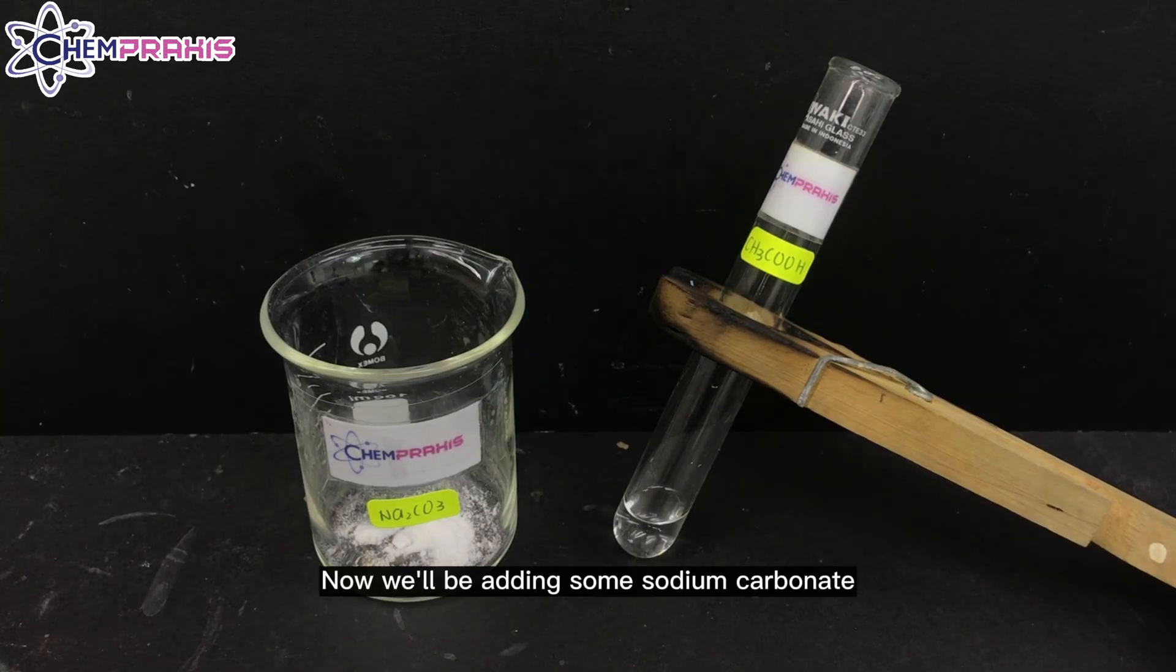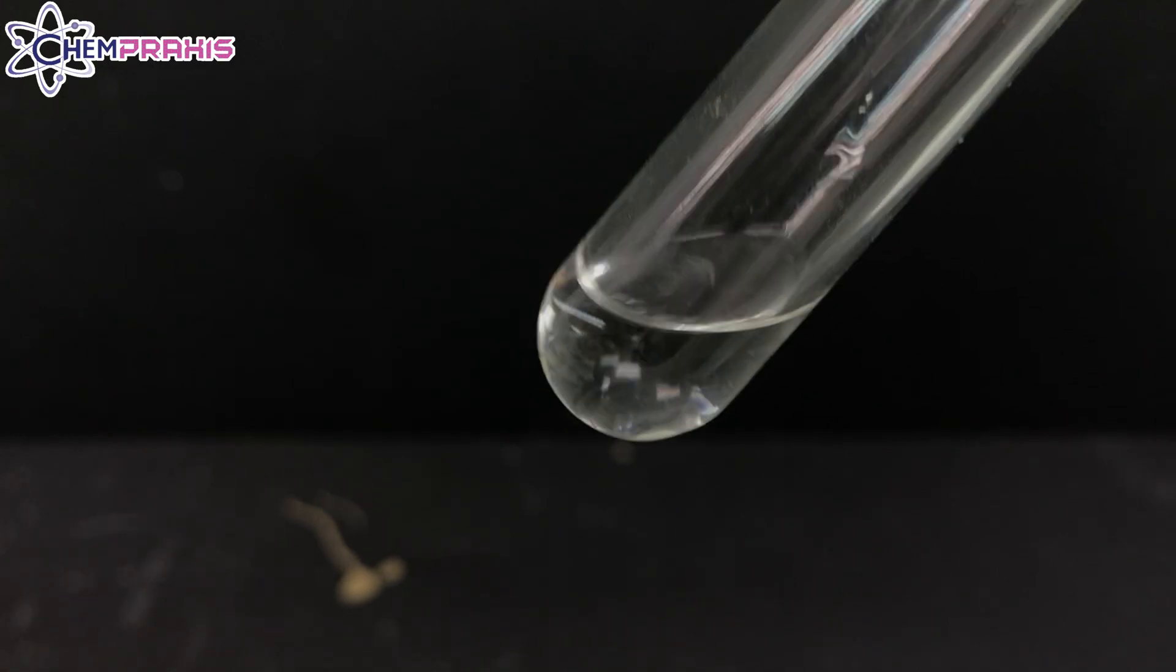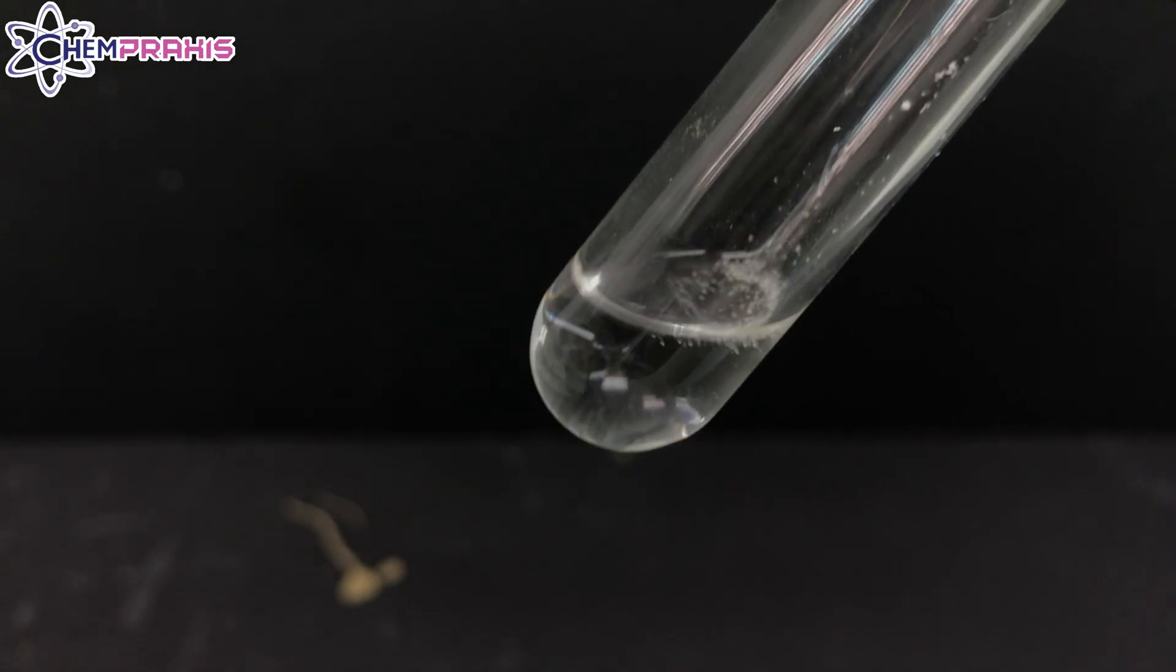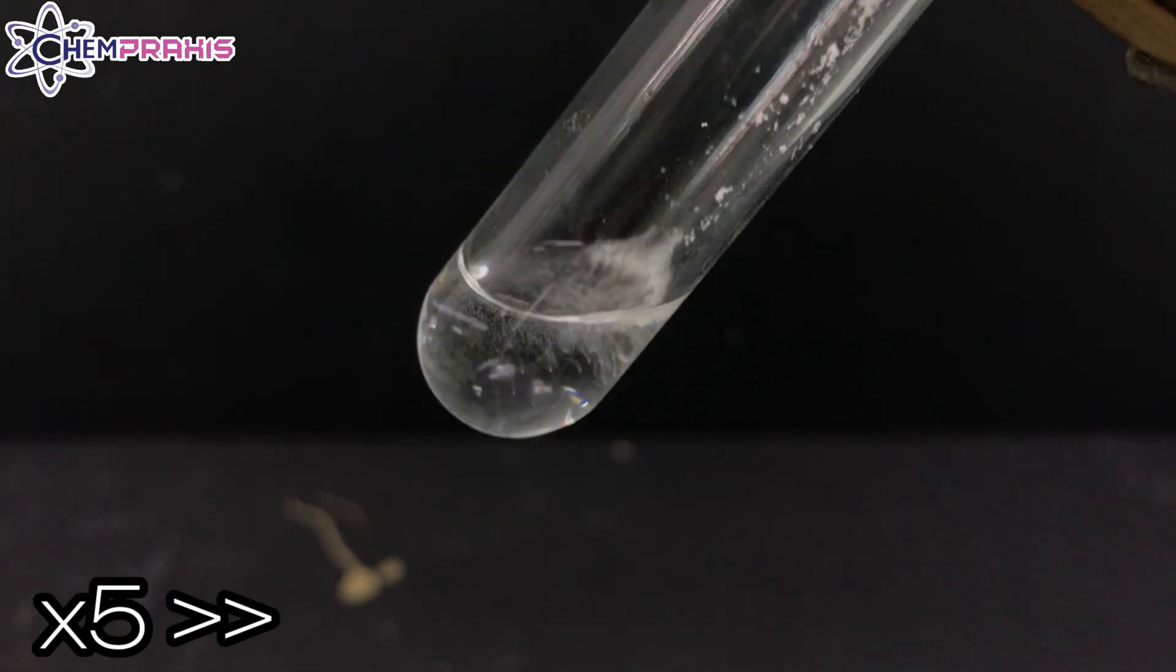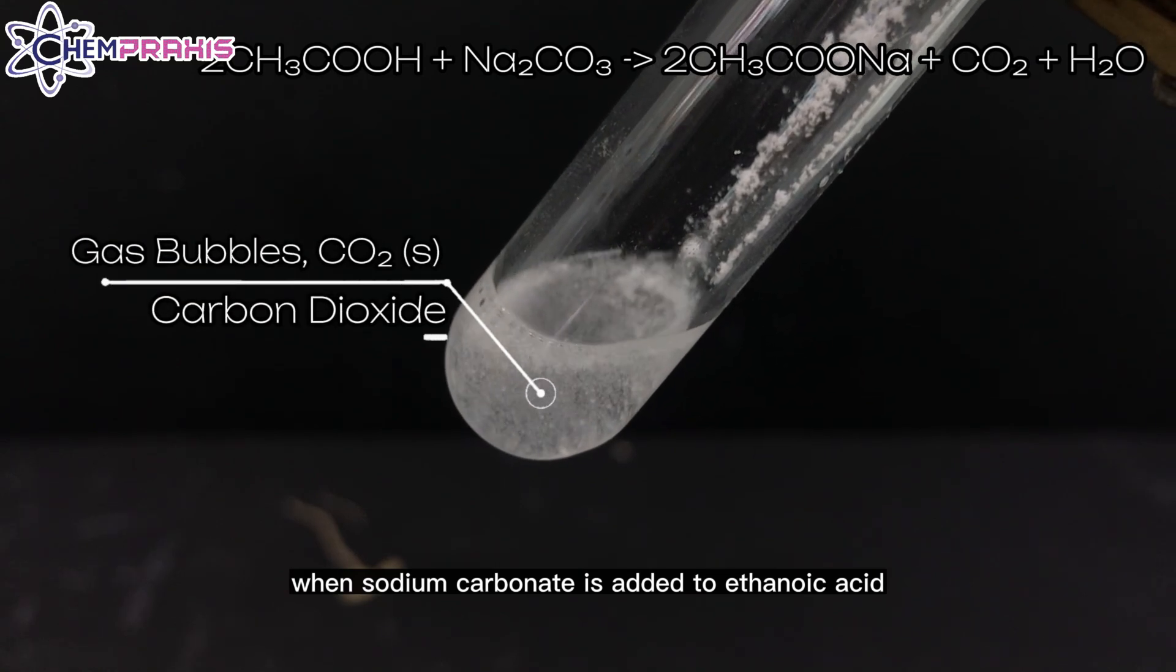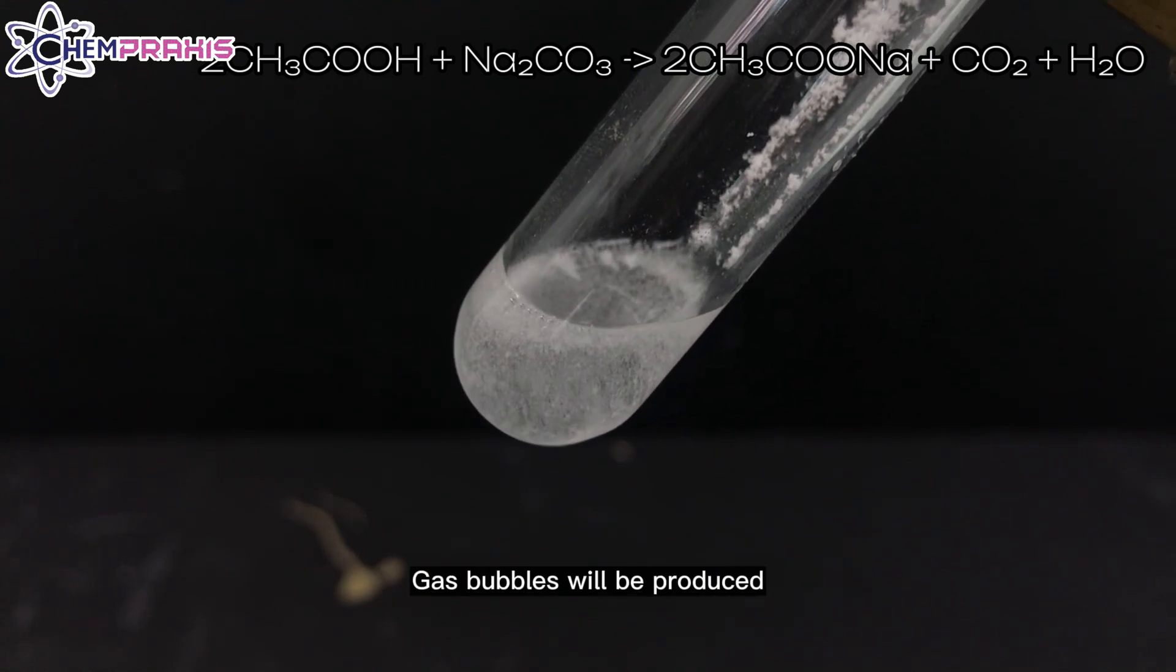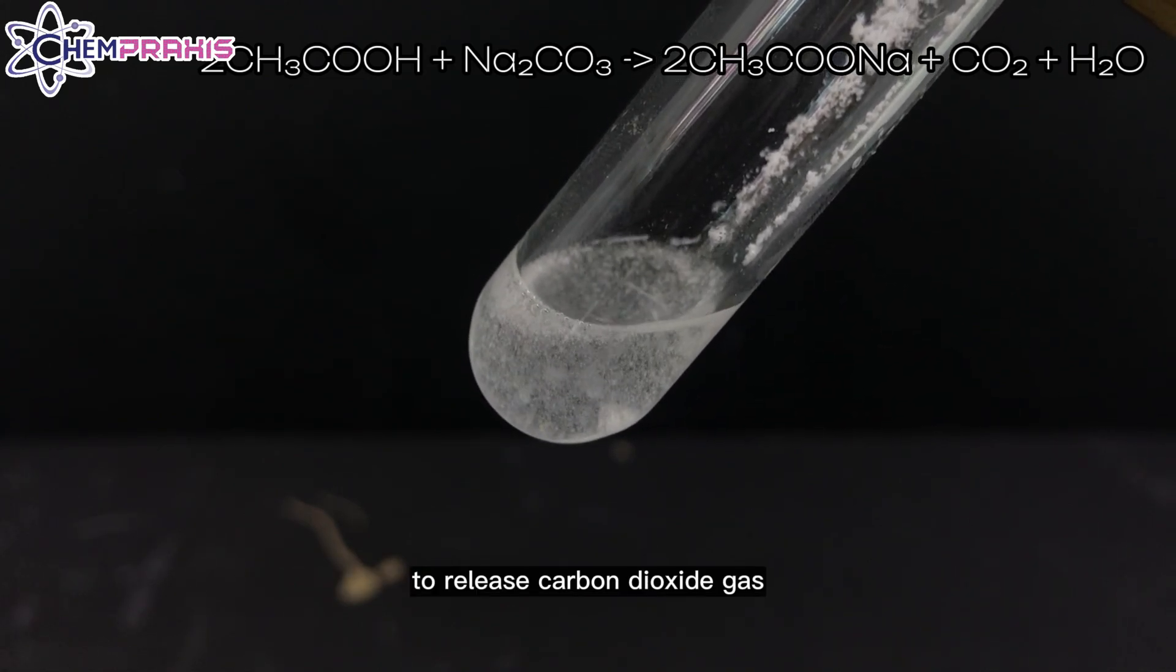Now, we'll be adding some sodium carbonate into the ethanoic acid. When sodium carbonate is added to ethanoic acid, gas bubbles will be produced. The sodium carbonate reacts with the acid to release carbon dioxide gas.